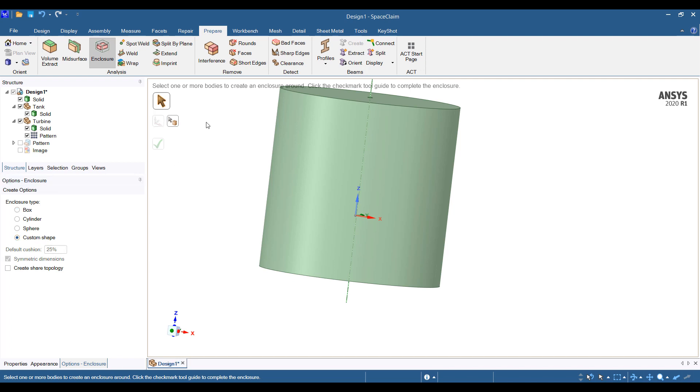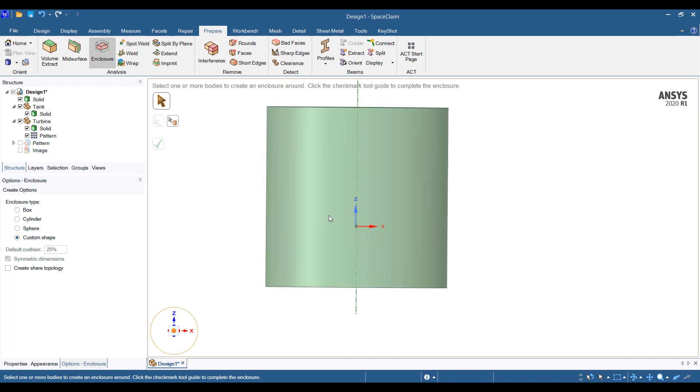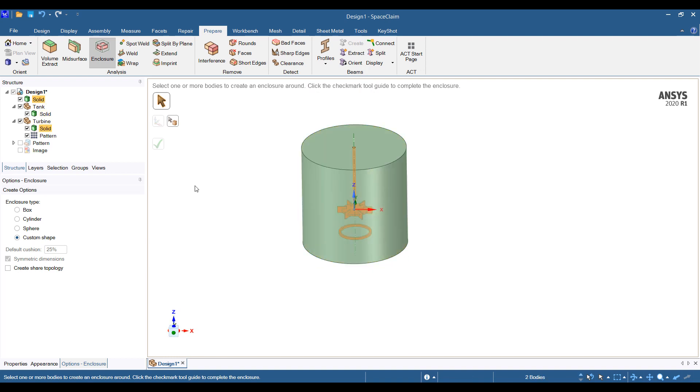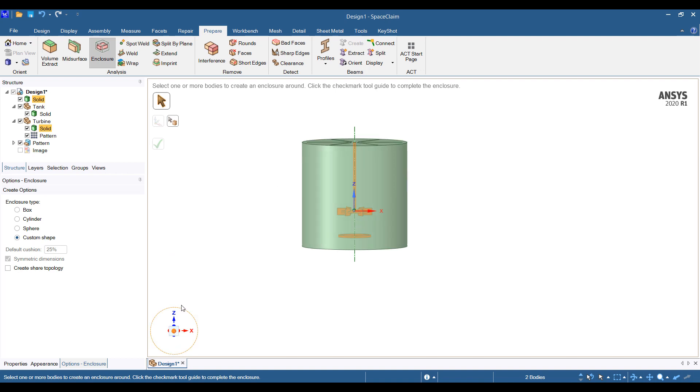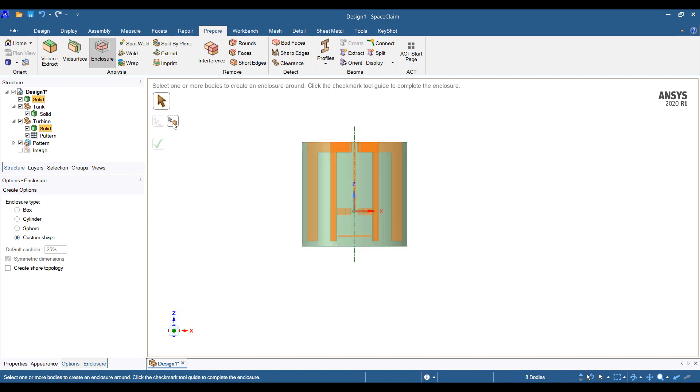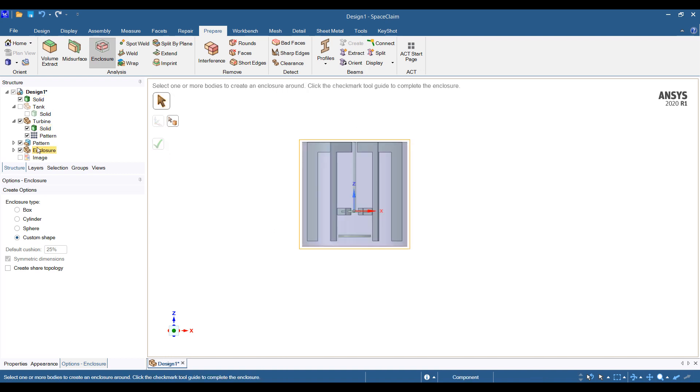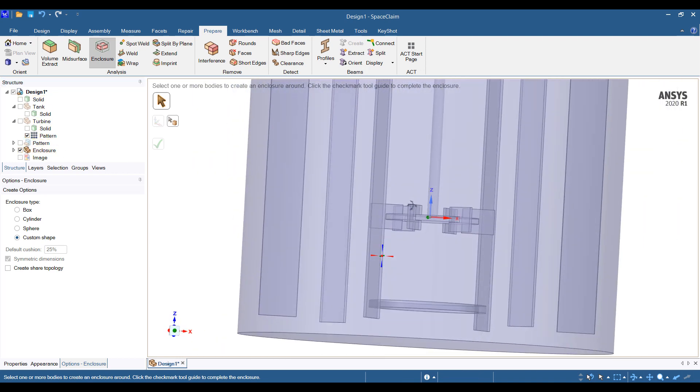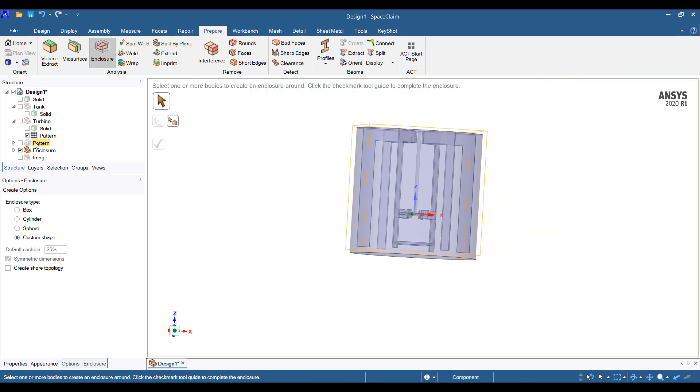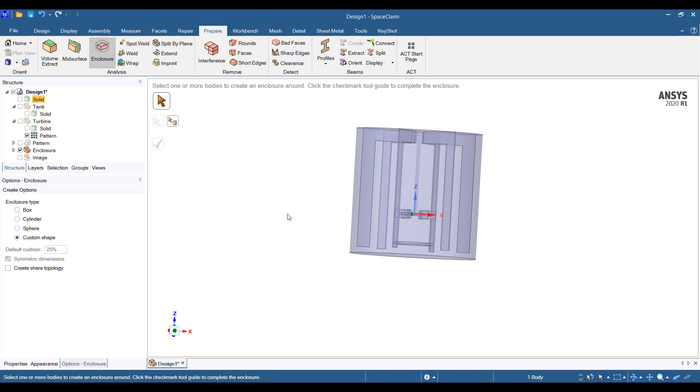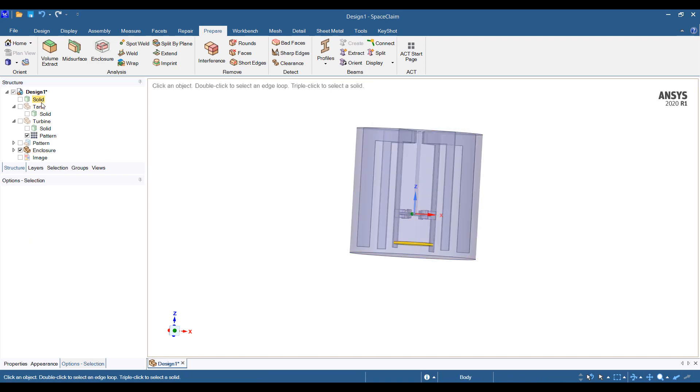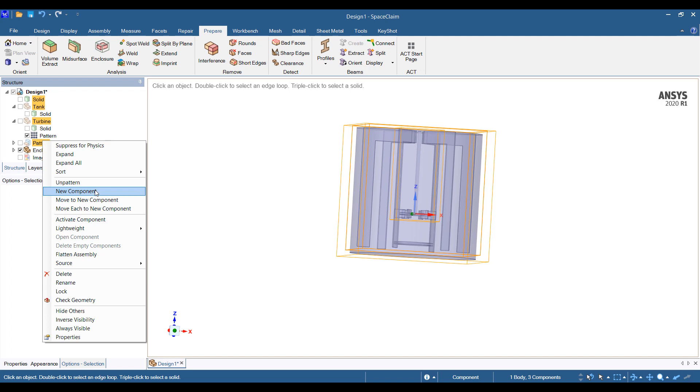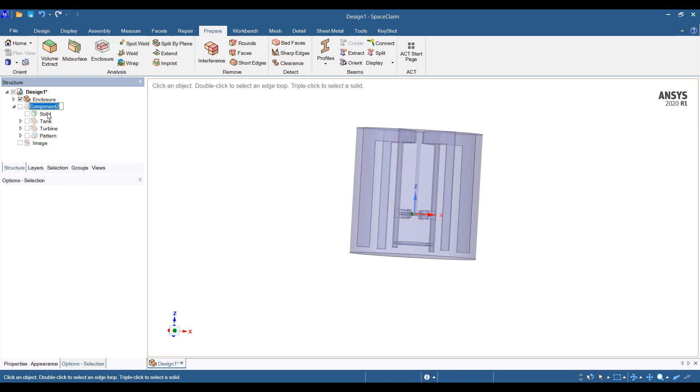So let's do the custom shape. We're going to select everything inside of this. We should need to include the patterns too here. Let's include all of these things. And the shape of the enclosure will be that. So when it's done we have an enclosure. That's it. So I'm going to select all of these and move everything to a new component, call it the old stuff we don't need, and we'll suppress this for physics.